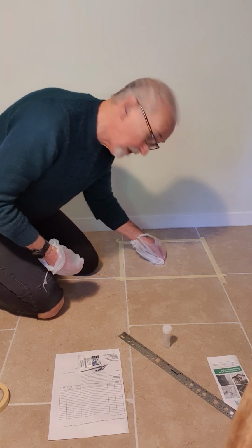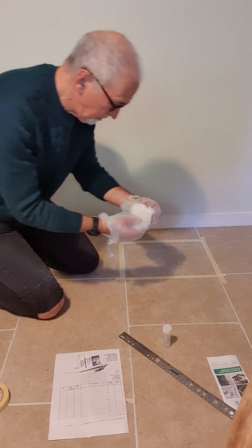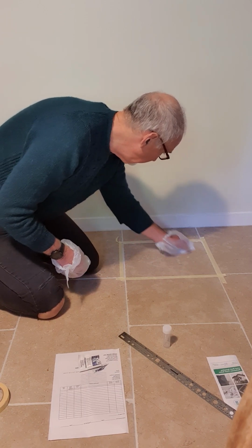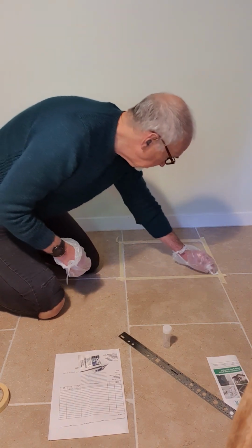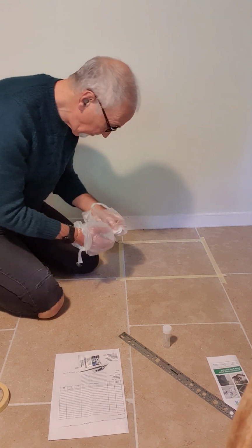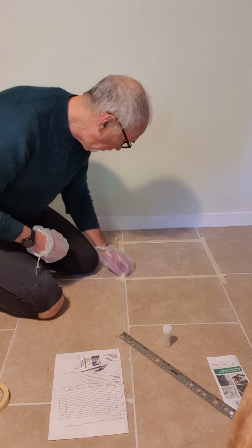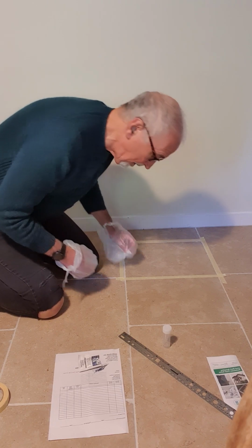I like to go in a different direction because I think, well, that's maybe picking up something we didn't pick up before. Then do it again, folding inside, and keep on doing the wiping like that. Do it again, keep on folding, and I like to go around the outside now because that's likely to pick up some contamination. Do it again. Basically, keep on wiping until you've got everything you possibly could off that surface. Fold again. Maybe do something like that.